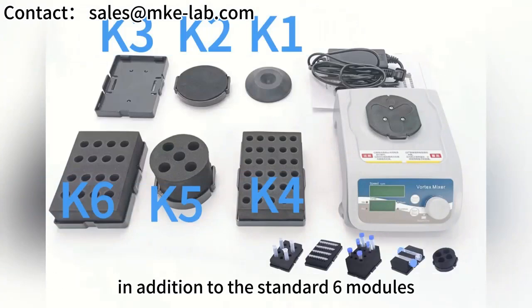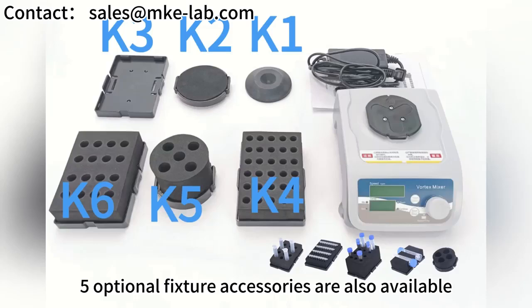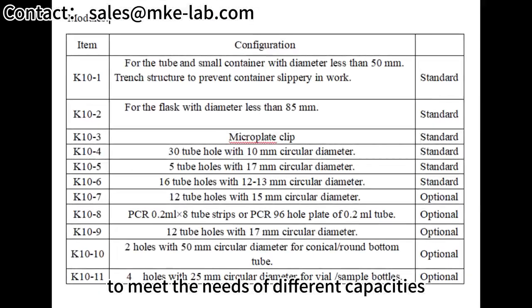In addition to the standard six modules, five optional fixture accessories are also available, to meet the needs of different capacities of test tubes and in-plate experiments.